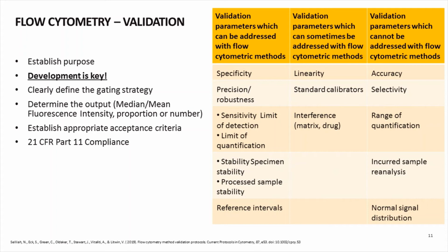When performing a validation, it's crucial to consider the purpose of the assay, as this will determine what parameters you need to assess. I can't emphasize enough how important the method development phase is. If the method isn't right, then you can have real issues in the validation. Before performing the validation, you should know what the endpoint you are looking at is. Establishing acceptance criteria that are appropriate for your assay is also important for a successful validation. These criteria should be tight enough that they meet the purposes of the assay, but not unrealistic based on the data from the development. Again, developing a robust method will help achieve the validated method you need.